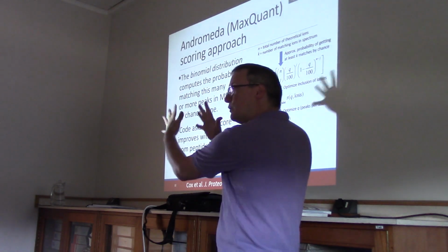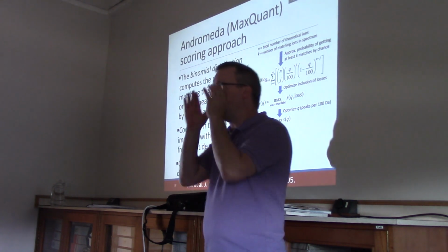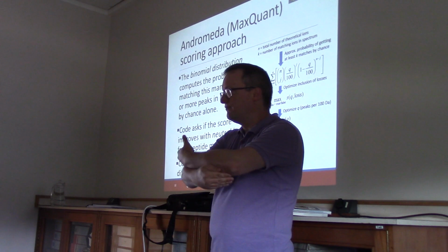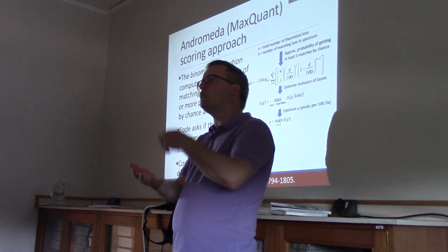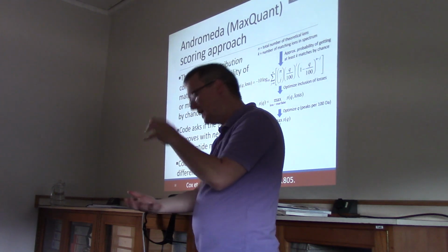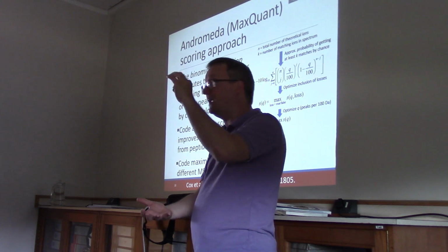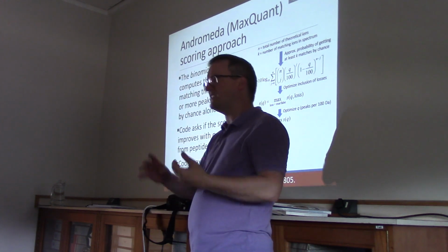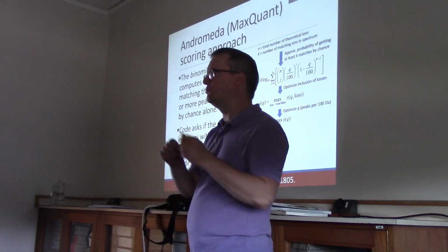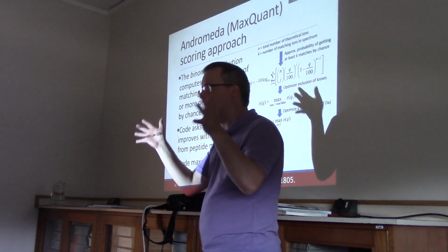Before we talked about rubbing one spectrum past the other and evaluating the alignment. We're not going to do any of that. Imagine instead that you have a jar of marbles, and this jar of marbles is mostly white marbles that reflects a place where there could have been a peak in the spectrum, but there wasn't. And it's got some black marbles in there too. Those black marbles represent places where there could be a peak, and there was one. All right, so let's say that you've got 9 times as many white marbles as you do black marbles. So the spectrum is mostly empty, but it's got a few hundred of these sticks in it.